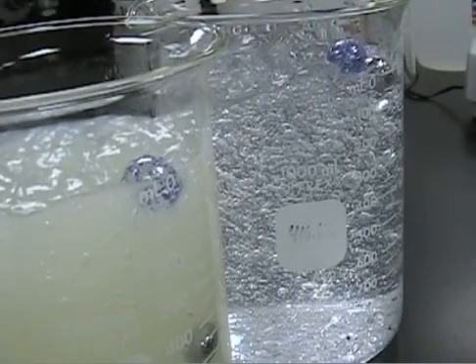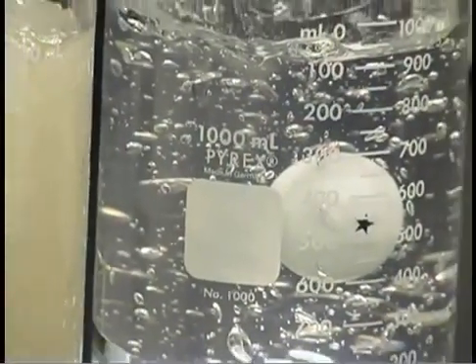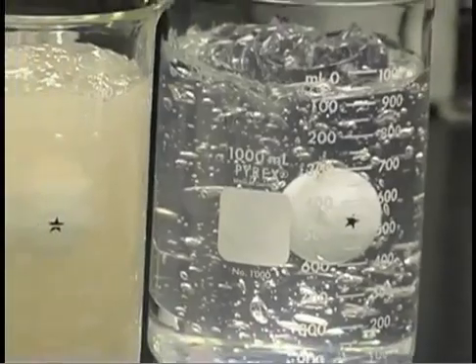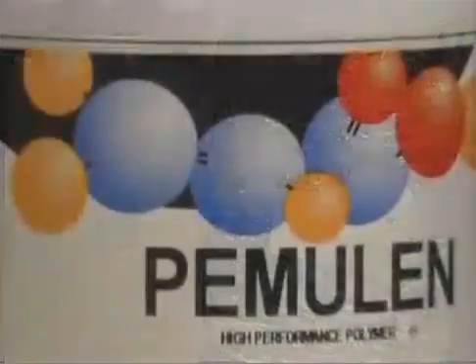The light sphere in the Carbopol gel demonstrates that yield value can also prevent an oil droplet from rising and coalescing in emulsions.